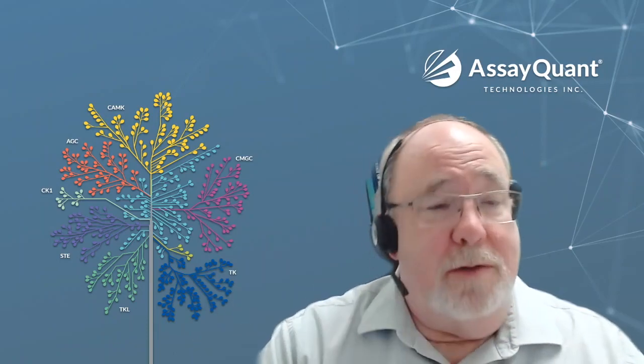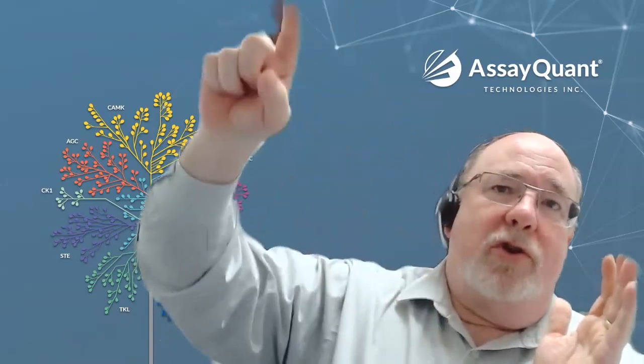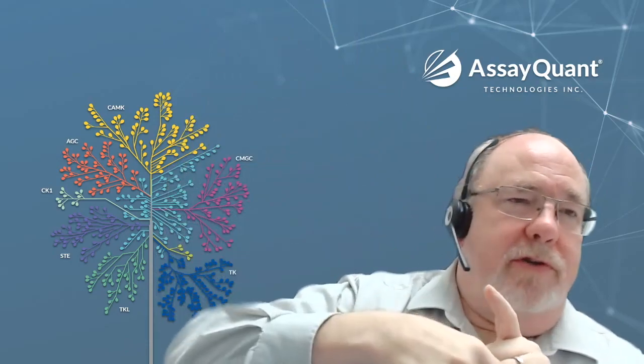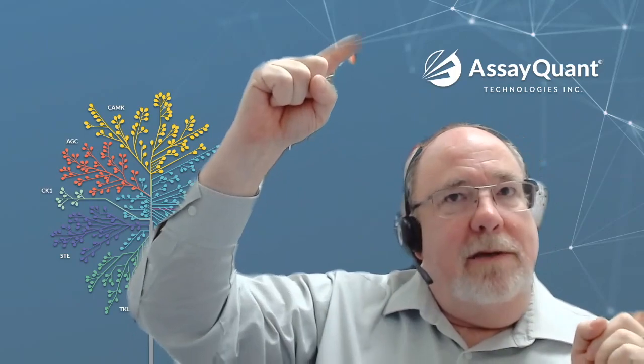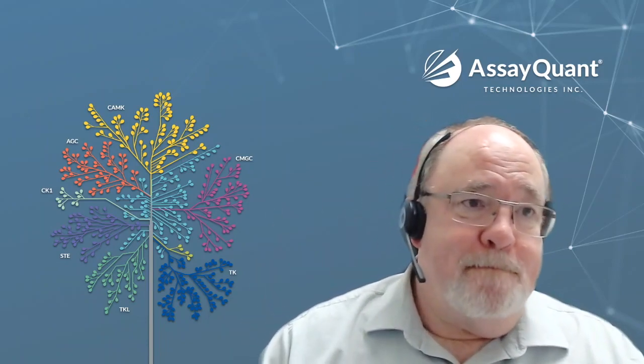So we have an automated linear range finding algorithm, and there's more information about this online if anybody's interested in learning it, that basically walks up and down the progress curve, finds the maximal rate, and then goes in one direction and the other to find out when it starts deviating from linearity based on a certain confidence measure. Once we define the top and bottom of that range, we say that's the linear range from which we're extracting the slope. And so that's how we get the slopes in an automated fashion from all of our progress curves.